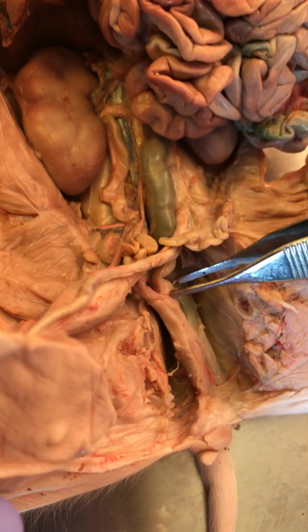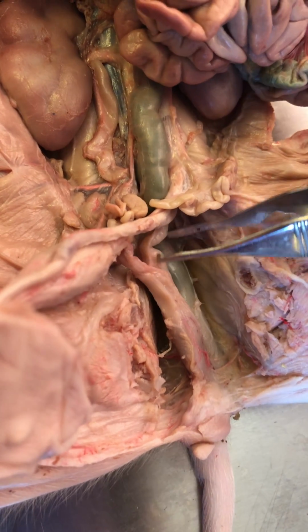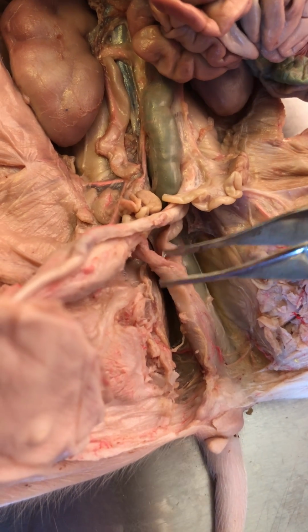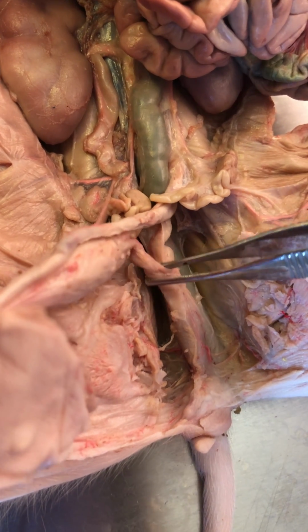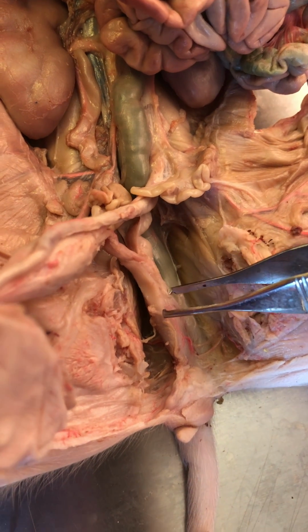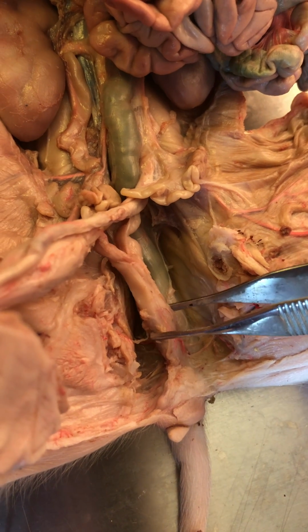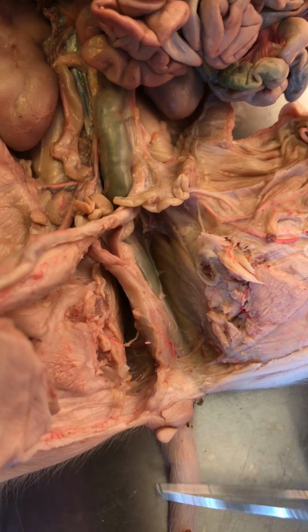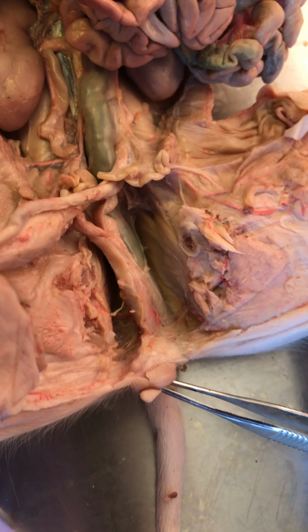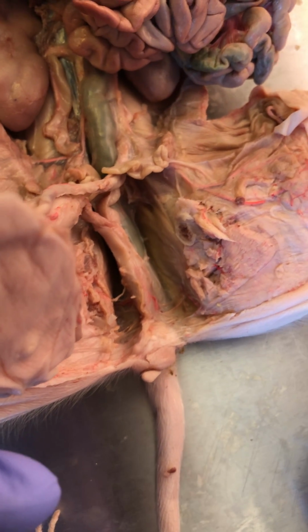And then from there, the vagina. So we have urethra, vagina, and they're separate, and then they're not. Look at that. Urethra, vagina, and then they're not separate. They're fused. They merge and then they fuse into a urogenital canal, which comes out to the common urogenital opening. So that is the female reproductive tract.